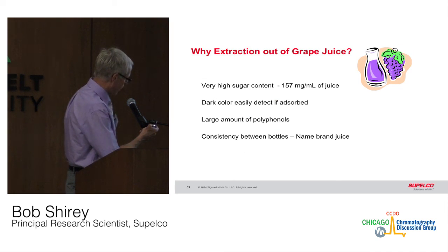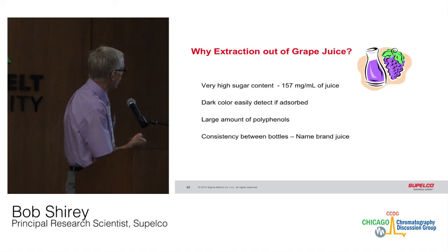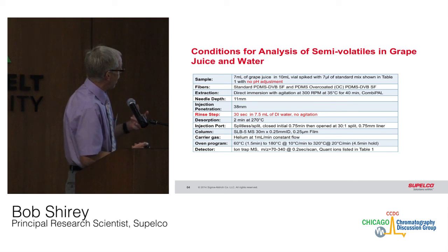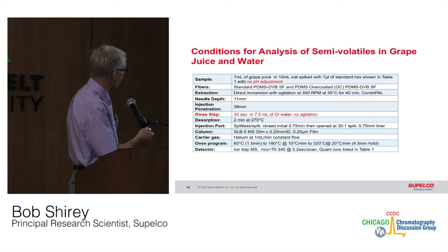So why extract out of grape juice? Because it has a very high sugar content, in this case 157 milligrams per mL, the dark color can be easily detected, and it has a lot of other non-volatile components in it. We used a brand name to try to retain consistency between the multiple samples. In this case, we put 7 mLs into a vial and immersed the fiber. The reason we picked the components we did is because they have very little volatility, so you have to immerse the fiber.